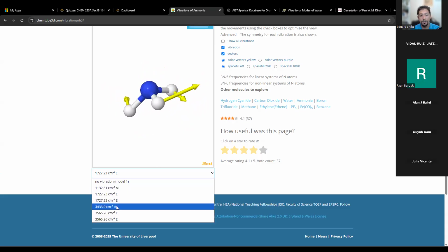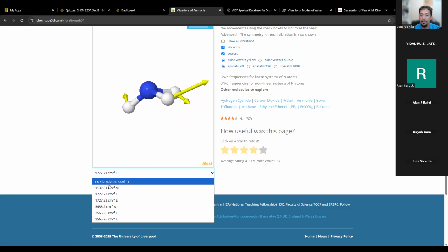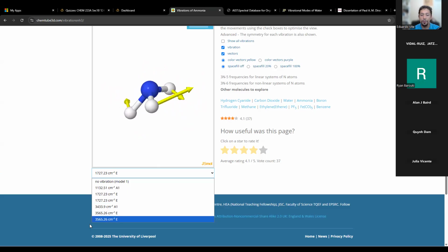Okay. And then you'll see so far we have all of our vibrations in the lower 1000s, upper 1000s, and suddenly we make the jump to 3000.